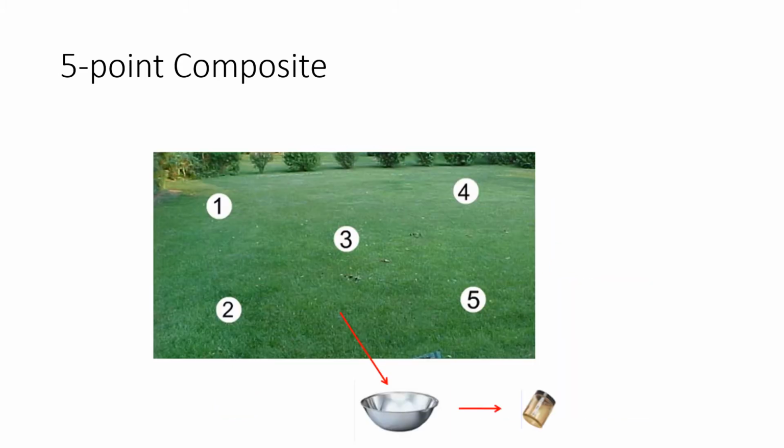A typical composite sample is assembled from a small number, like 5, discrete samples that are combined in the field. The component discrete samples are typically collected in a quincunx pattern or a die pattern, as is shown here, that may or may not be of equivalent size or mass. The samples are typically mixed in the field and placed in the sample containers specified by the analytical method. The sample volume and additional sampling processing can vary. This method is not very rigorous typically and is not usually used in HRSC soil sampling applications.